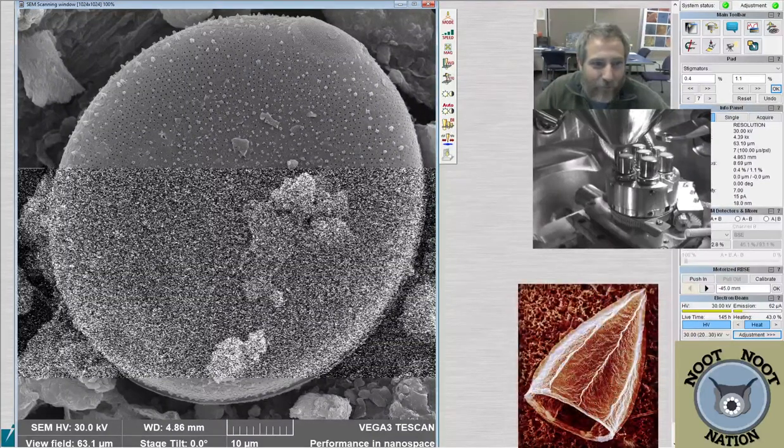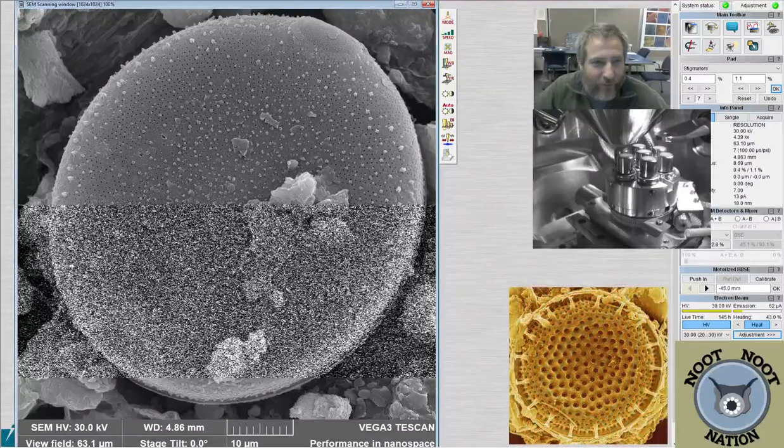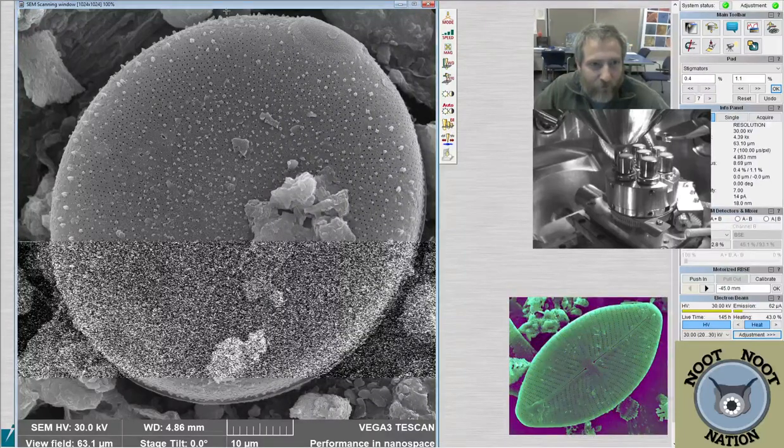And you can see there's the rimaportula hole we were looking at earlier. So these are the ocelli. They're like little eyes. I like to think of this diatom as sort of like an alien head. And as I mentioned, it's kind of egg-shaped, so it's not perfectly round. And then you can see there's a whole bunch of little ornamented spines around the outside margin as well.